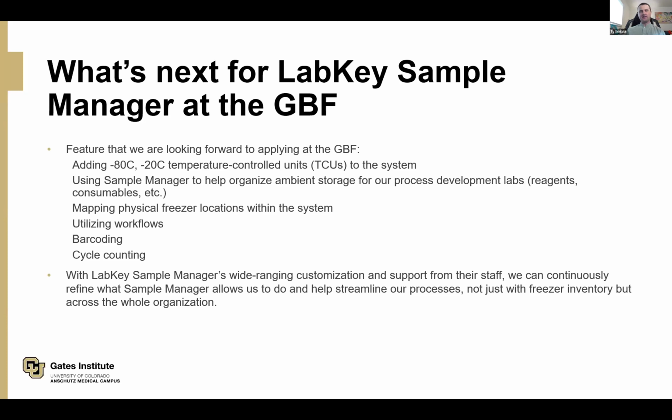Barcoding is another one that we find really useful. We're really looking forward to adding that into this system so that we can be even more efficient when it comes to checking in and checking out of those samples, and ensuring that all that data is stored on just the scan of a barcode.